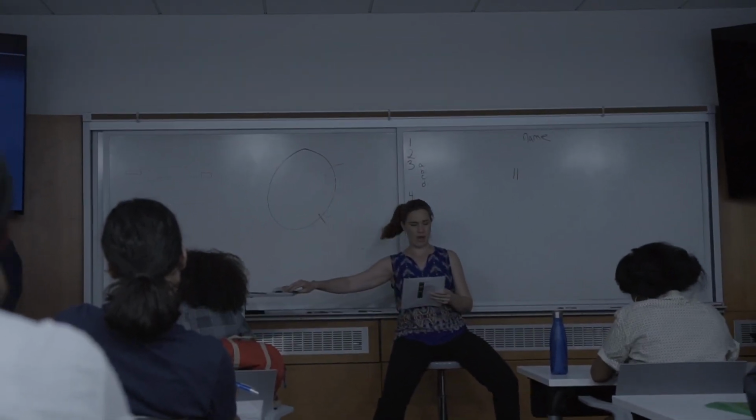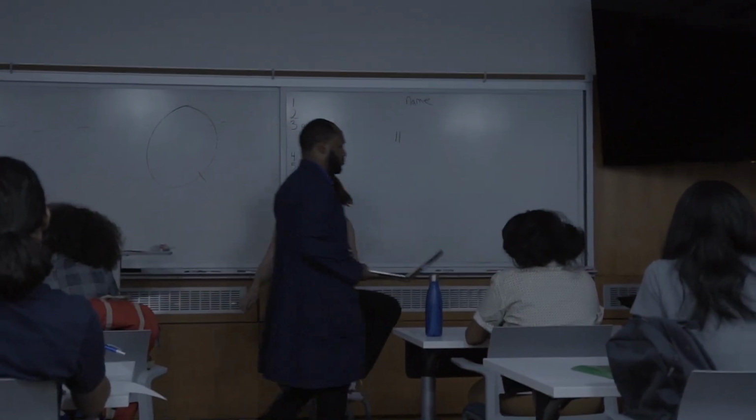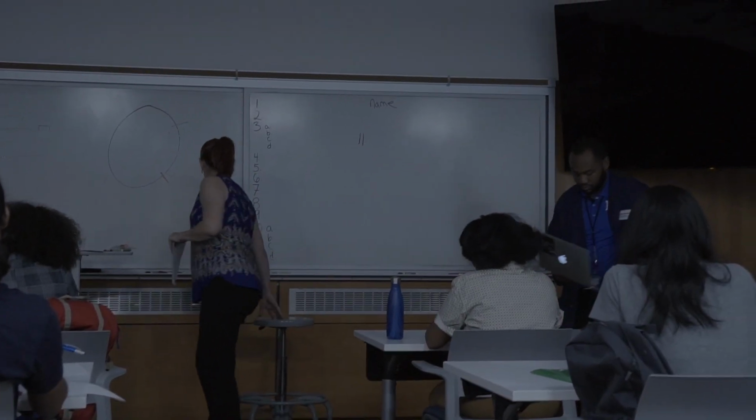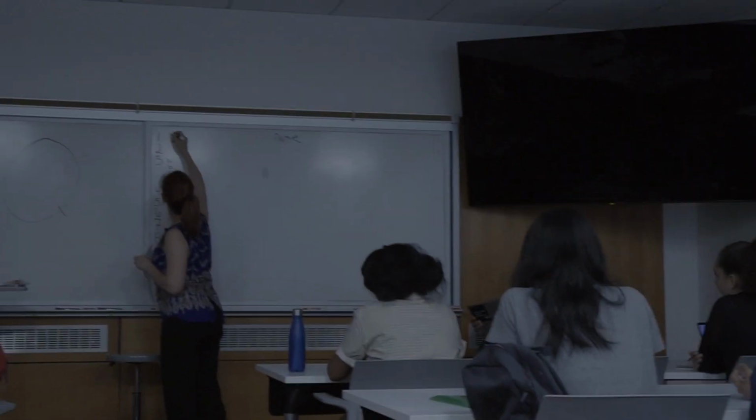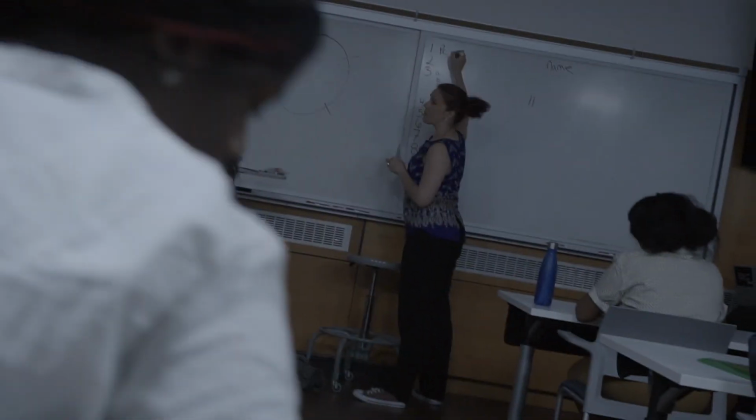And we'll film it as we go. So, first question: what is the name of the piece of equipment that we ran our PCR reactions on? So just keep it to yourself, just write it on your paper. This is individual. Does everyone have a piece of paper?